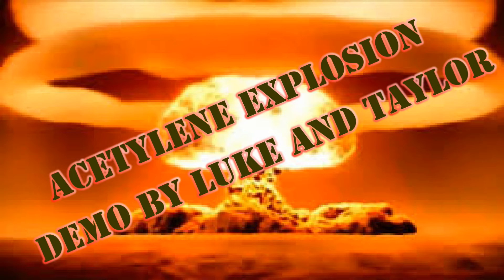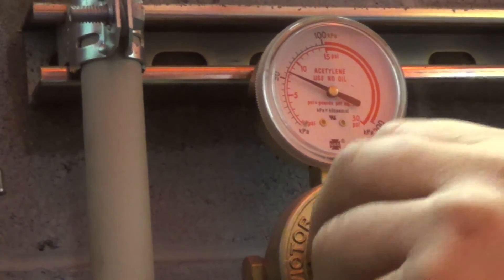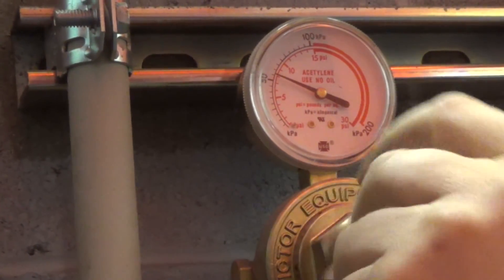Okay everyone, so today we're going to be learning about the destructive properties of alkynes. Now alkynes make up the basis for our explosion video.